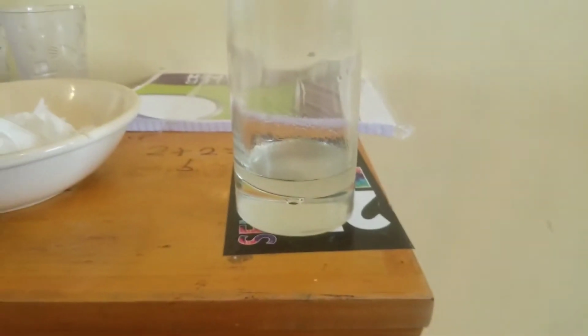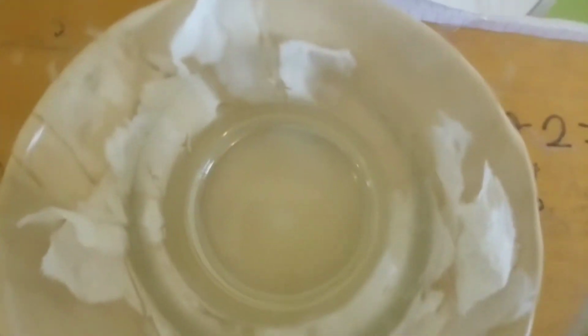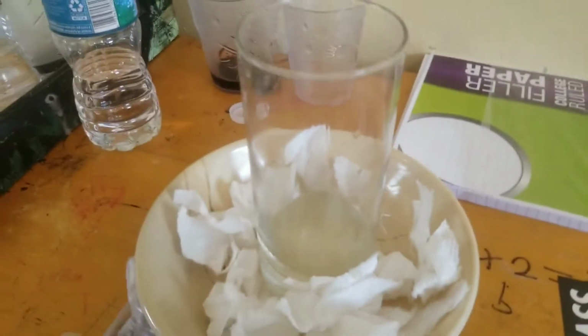And then what we're going to do next is put it in an ice bath. This is it in the ice bath, and also the thing that was formed from heating it up was aluminum sulfate. Alum crystals should form within 20 minutes.